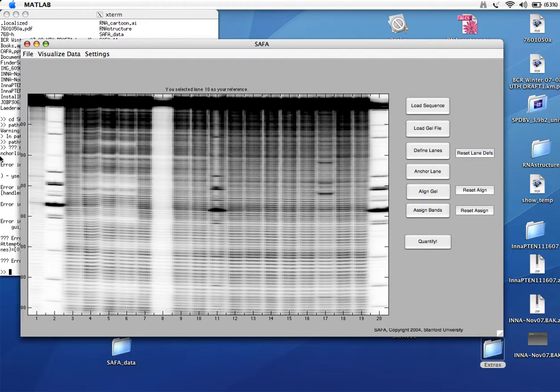If you had a strange smiling or frowning pattern on your gel, where, for example, the smile occurred in the first 3 lanes, and then the gel was pretty straight, you may want to select your reference lane at the asymptote of that smile. But in most cases, you're pretty safe picking a lane in the middle of the gel.